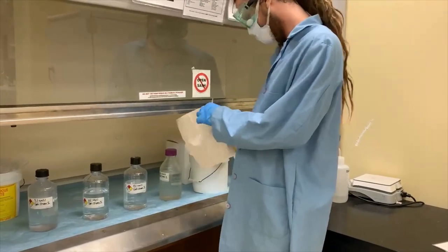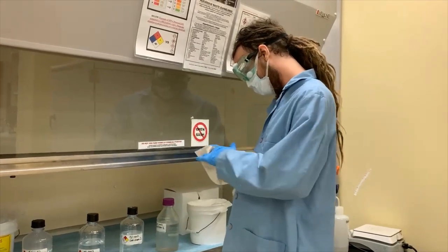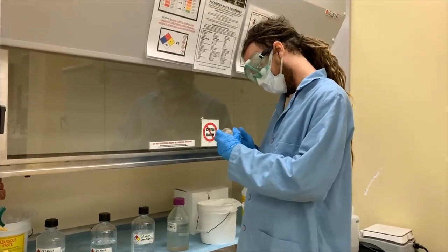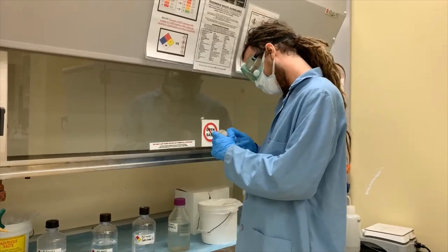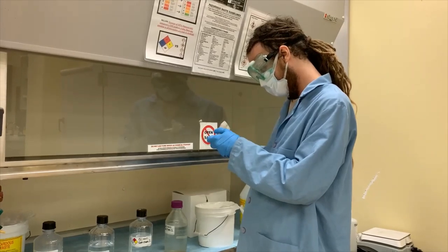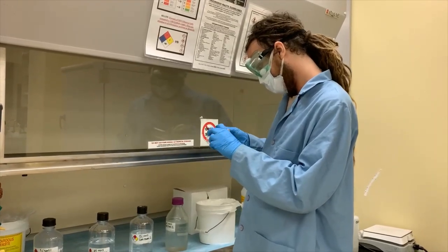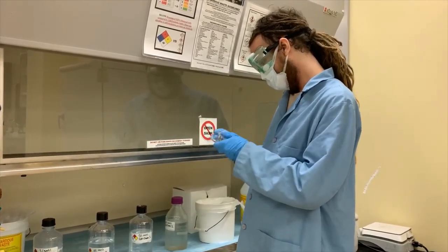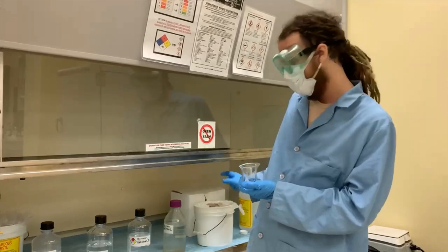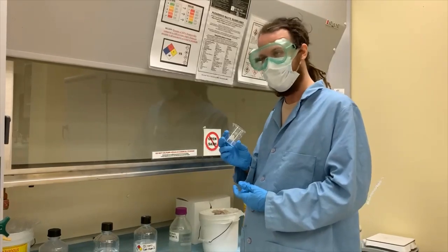Paper towel to kind of rub along the edges. We'll dispose of the paper towel in the hazardous solid waste bin, and I'll go ahead and finish cleaning this off camera.